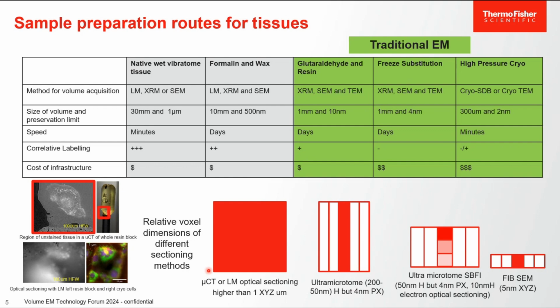And so again, this is very tongue-in-cheek. So there's a lot of examples one way or another. But really, when you're doing ultramicrotomy, you're taking relatively thick sections. But for the right scientific question, that's fine. Maybe you want to take a few large area overviews and then be able to localize some subregions quickly.